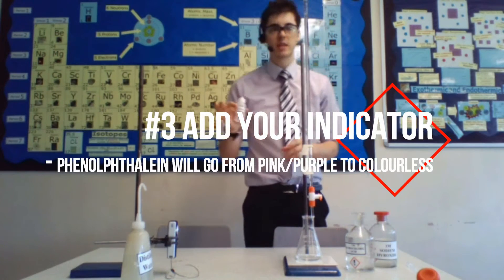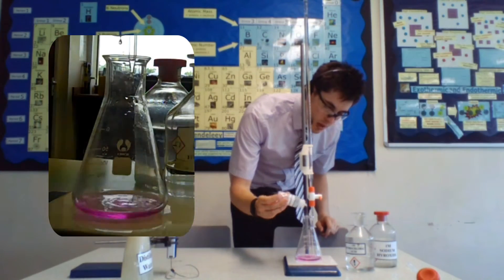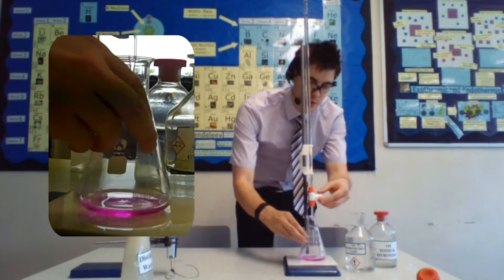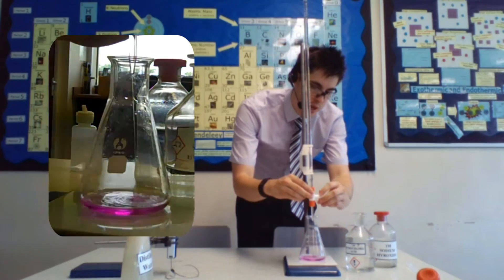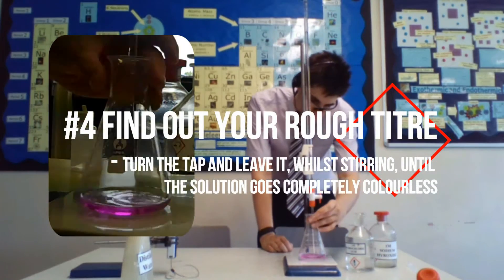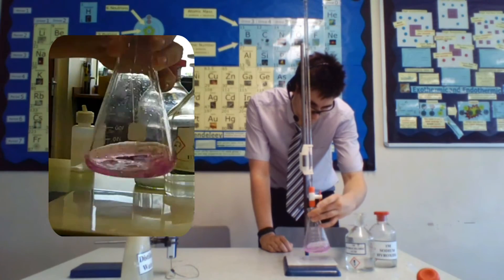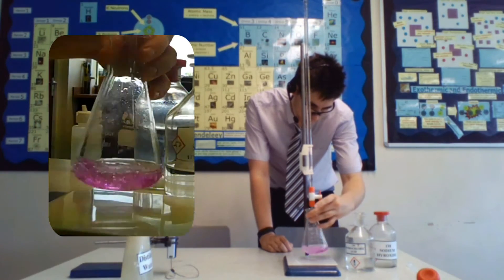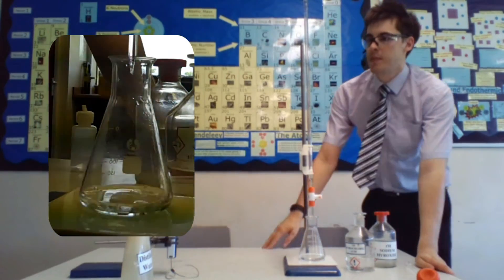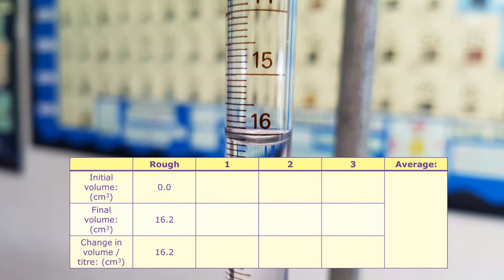Then take some indicator — in this case phenolphthalein — and put a few drops in so your sodium hydroxide solution goes pink. You're then going to turn the tap on your burette and let it run until it goes completely colourless. Keep stirring, and stop the tap when it's gone colourless — that happened at around 16.2 cm³.